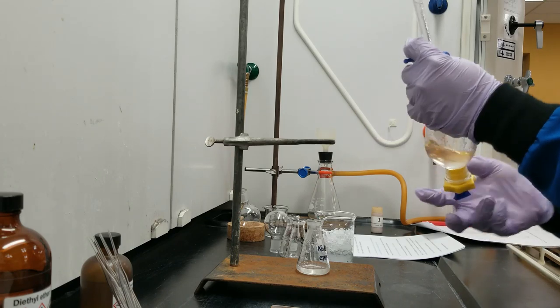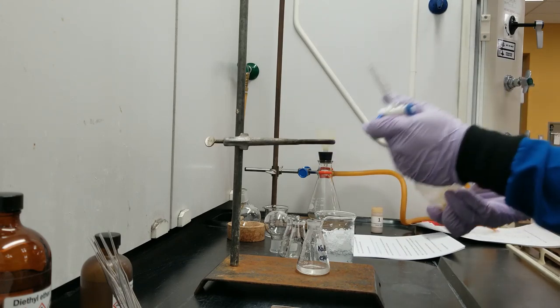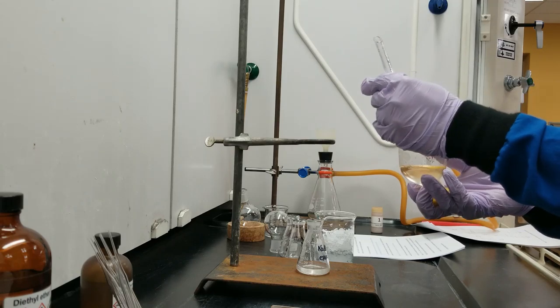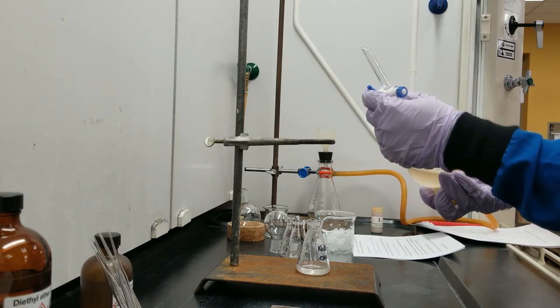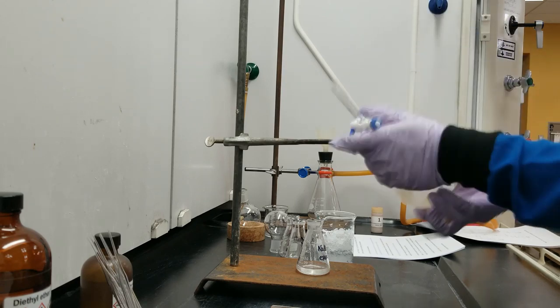Remember to vent when performing liquid-liquid extraction, because if you do not vent, then pressure might build up inside the closed system and it can explode the flask.